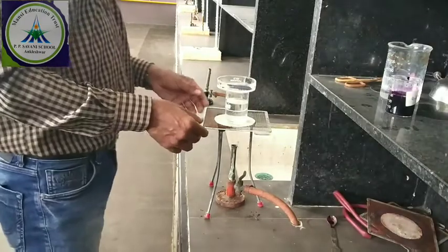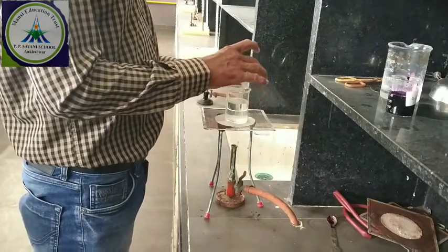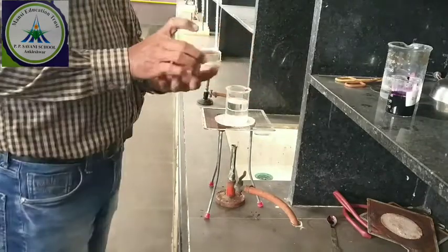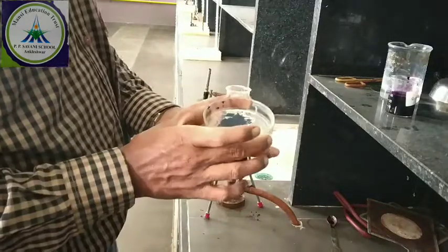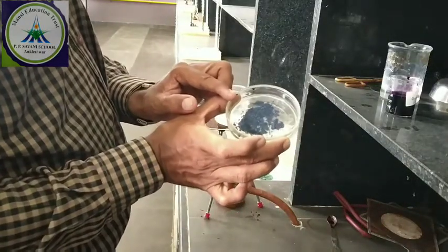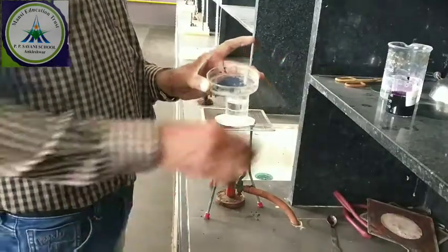If you heat for 10 to 15 minutes, vaporization stops and crystals of dye will appear. You can see the crystals of dye appear. So we can separate these dye crystals from the solvent.